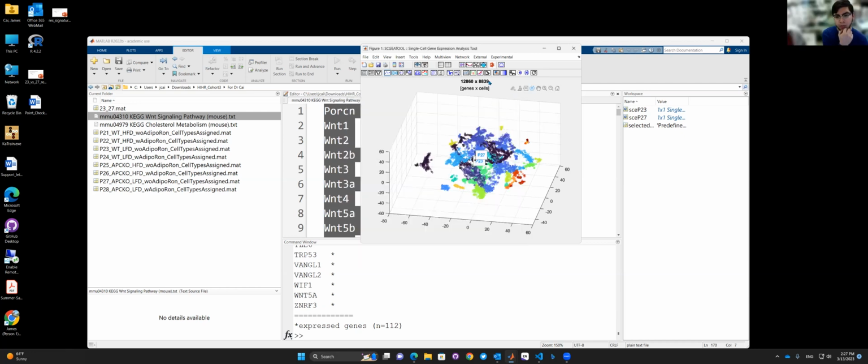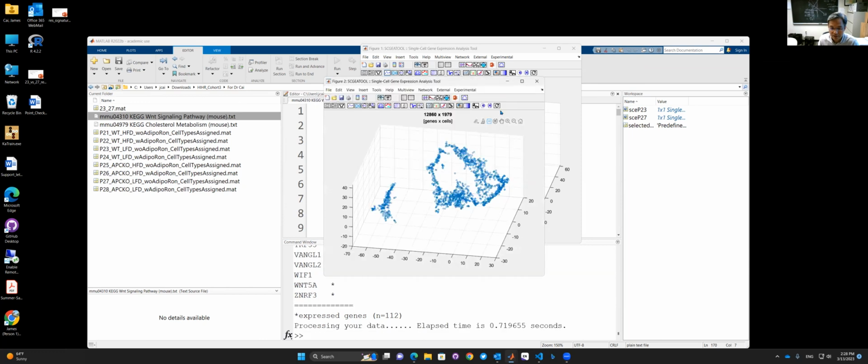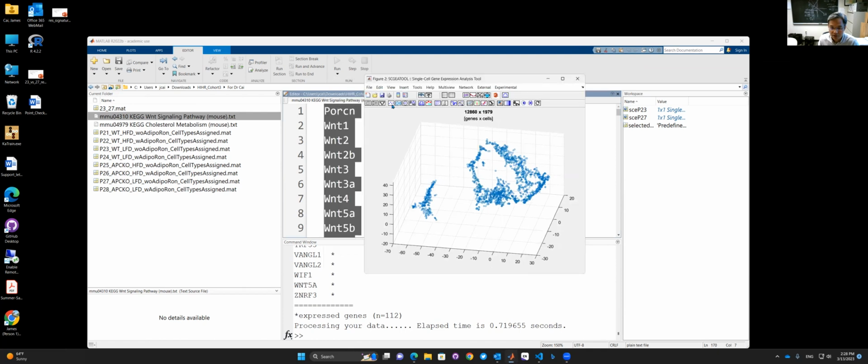Okay. What I will do is from this button here, first click this button to select cell type. I know EC is the major one, so I can select EC and extract. So you can look at their batch ID.